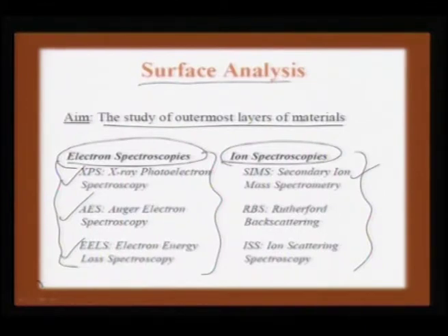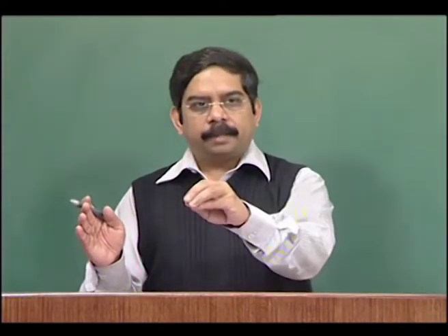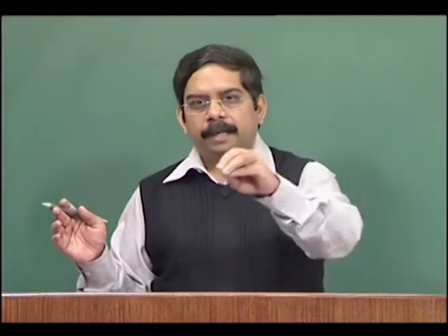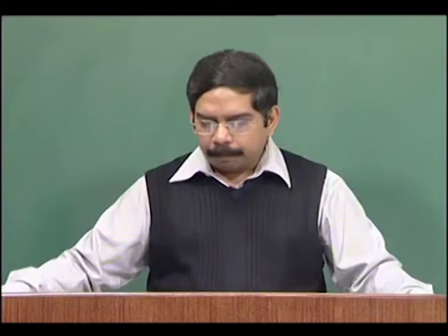One is SIMS, that is secondary ion mass spectroscopy, which can give you very refined information on all the corresponding elements or impurities that are present in the surface, or Rutherford backscattering, which is another very sophisticated tool where a helium ion is sent into the lattice, and if the lattice is ordered, then you have good channeling, but if it is a disordered material, the helium ion will get scattered back, and therefore you can look at the length of this ordering of the lattice, or how orderly the lattices are developed during the process can be mapped, and especially those who are involved in thin film technology use RBS as a very sophisticated tool which can give you a clear insight into the epitaxial growth of the film.